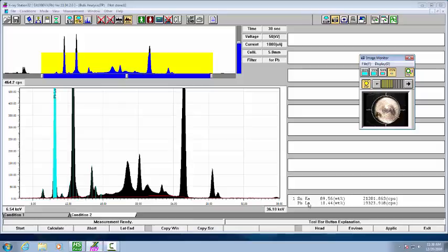I have not calibrated for this. This is using PureFP standardless method. No verification to any other standard has been installed.